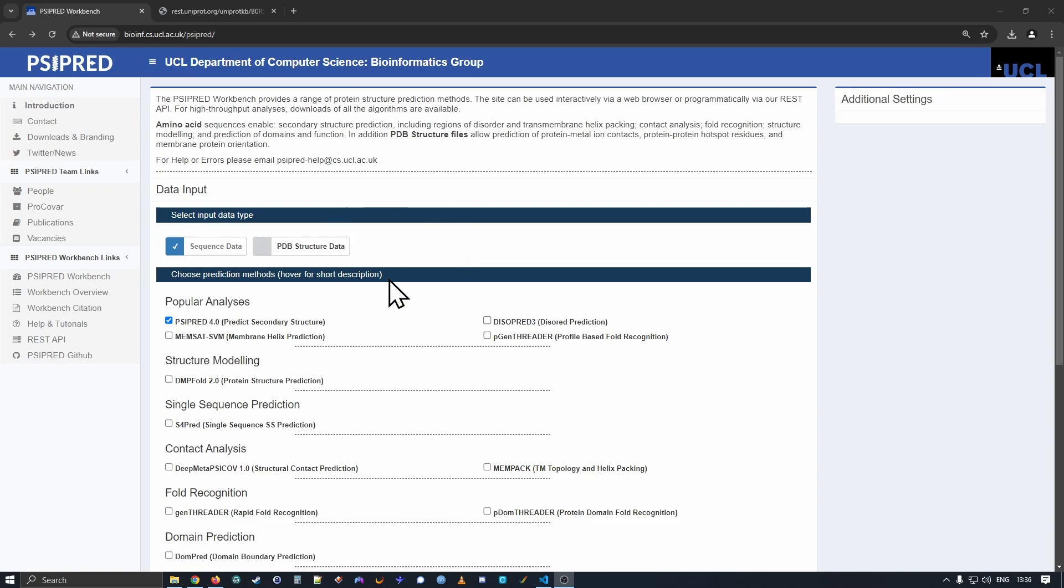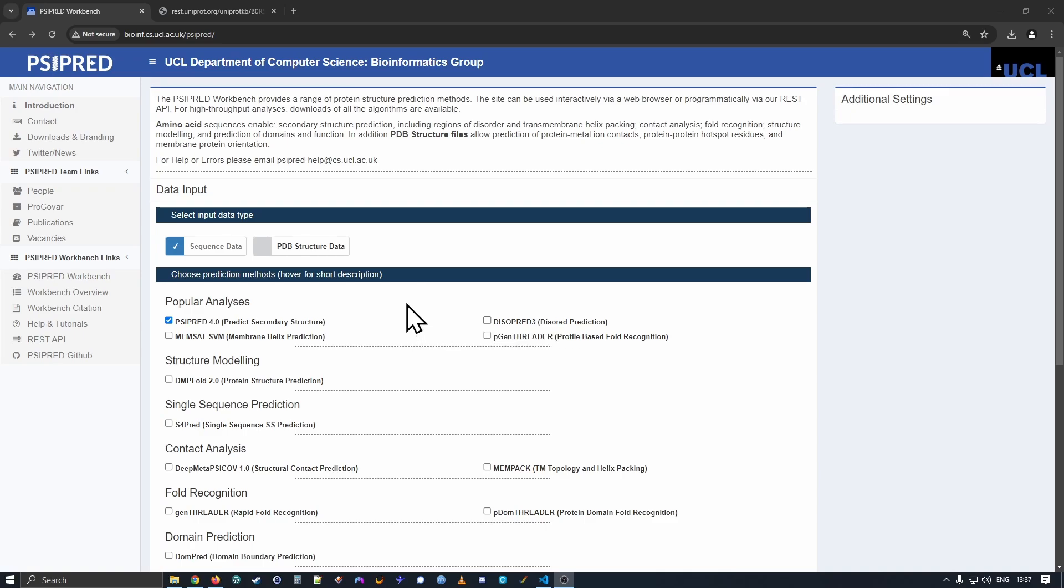When you arrive at the workbench, you'll be delivered to the Sequence Data Input form. Here you can select different methods to analyze protein sequence data. We'll look at analyzing protein structure data in some future videos.